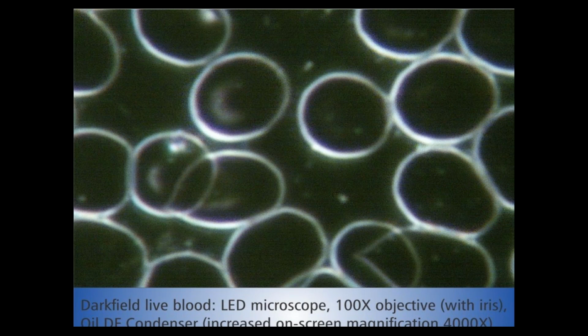Okay, so the amount of light that the objective allows through plays an important role, especially in the 100 times objective. So the type of dark field condenser you use also affects how much light is allowed through into the sample, is it? Yes, it is, absolutely. When it comes to the type of dark field condenser, the oil immersion type is the only one that really should be used for live blood analysis. The reason for that is again related to the amount of light allowed into the sample, which then determines what you'll ultimately be able to see in the sample.